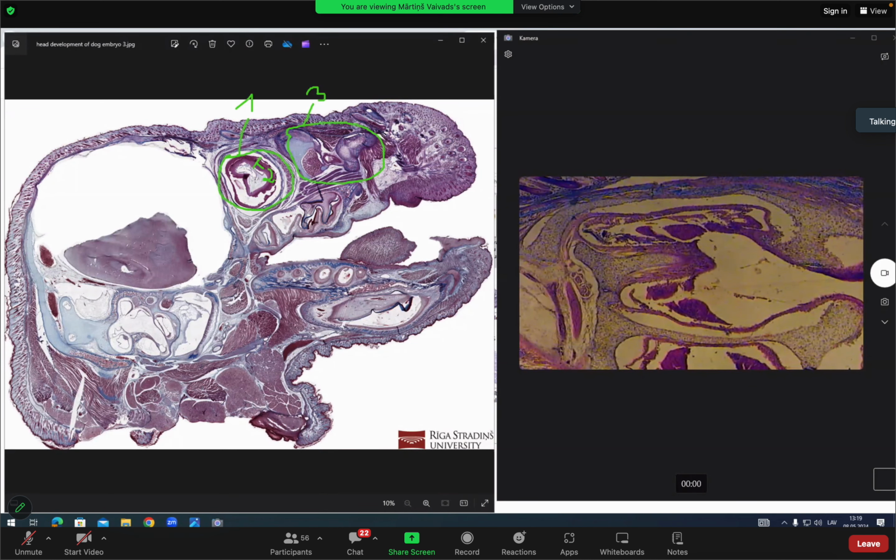This slide is not exactly the same as in the picture, but it has some similarities. And here in this developing nasal cavity, if you see hyaline cartilage, again, you can use nasal cartilaginous capsule. This is the name that's used sometimes. Or if you just write nasal cavity development, it will also work. But sometimes for this cartilage, you use the specific term.